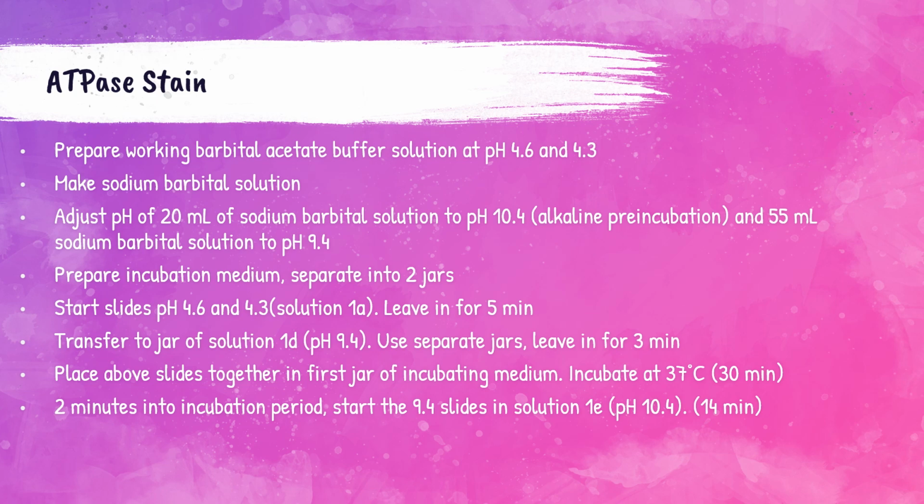Okay, and forgive me, I said 50, I meant 55. So 55 milliliters of that sodium barbital solution to a pH of 9.4. I misspoke, forgive me. So to prepare the incubation medium, you want to separate into 2 jars.